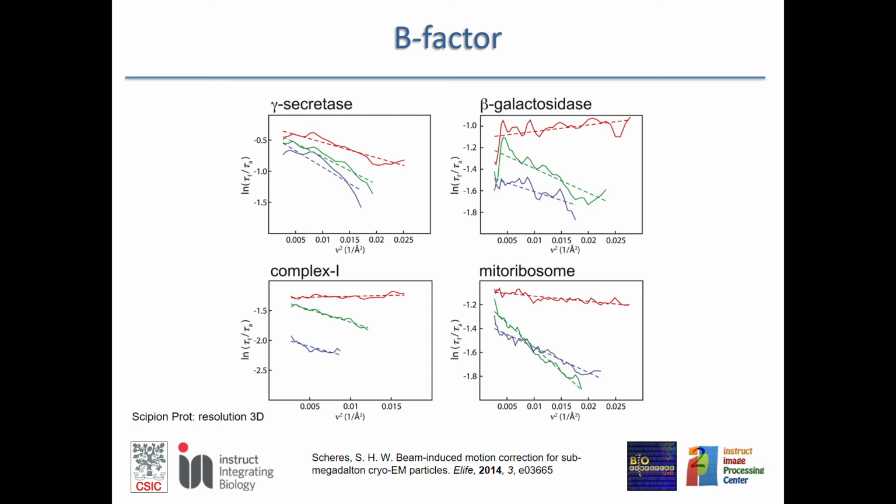If you have a structure whose B factor goes up, then that is a bad indicator. And actually, proteins have a relative range of B factors, and I don't want to give a specific range written in stone, but it is somewhere between 150 angstroms squared and, let's say, 20 angstroms squared.